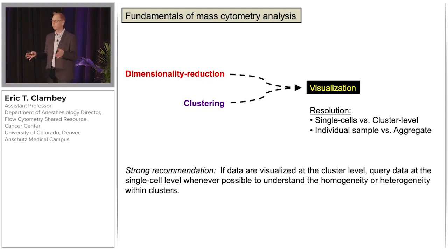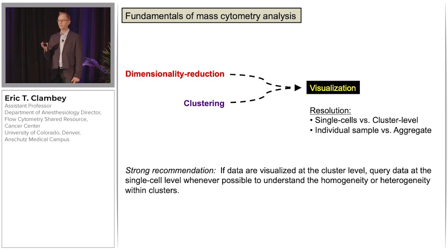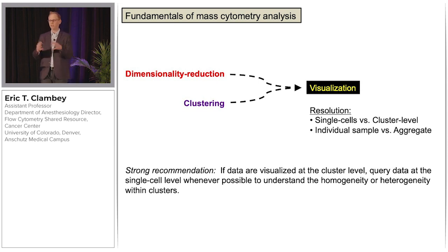If you are using a clustering algorithm, I strongly recommend, if you have an interesting cluster, that you interrogate that cluster at the single-cell level to ensure that there is homogeneity and that you haven't accidentally discovered some hybrid cluster, which is basically a combination of two different cells.